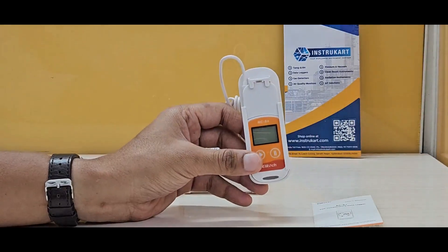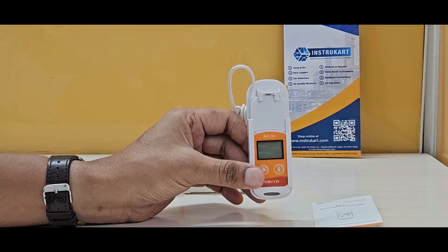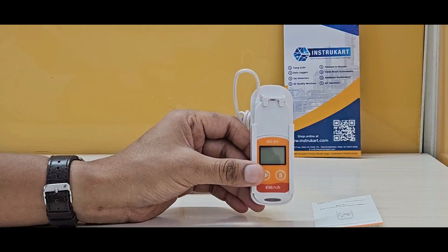This has a range of minus 30 to plus 70 degrees Celsius, with an accuracy of plus or minus 0.5 degrees Celsius and a resolution of 0.1 degrees Celsius for temperature.